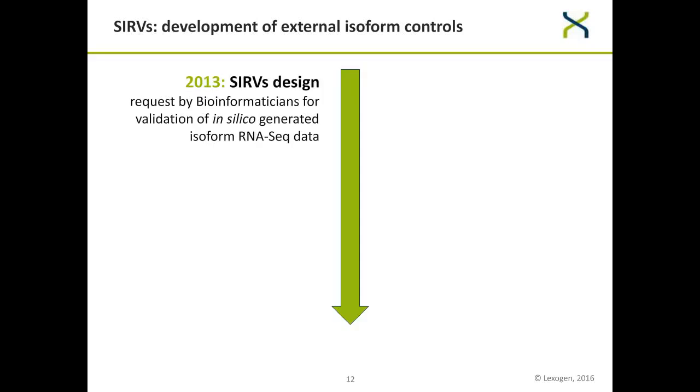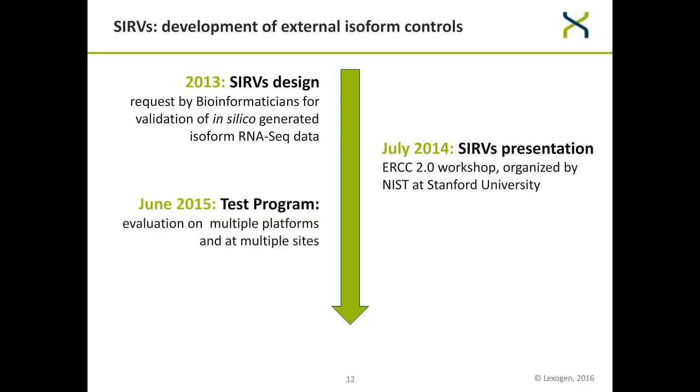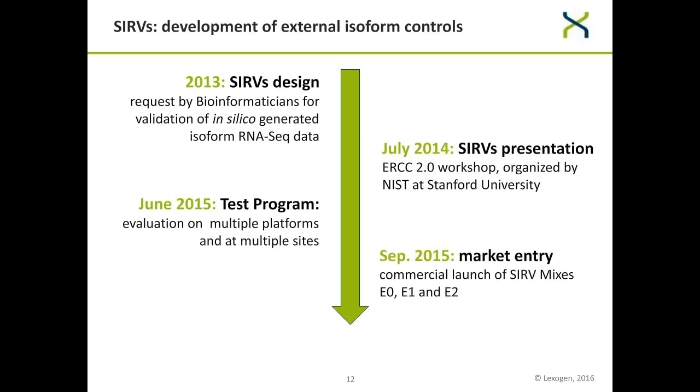So in 2013, we designed the SIRVs, which were then presented in July 2014 to the ERCC 2.0 workshop. This is an initiative promoted and fostered by NIST. The next year, we had a test program where the SIRVs were evaluated on multiple platforms and at multiple sites. We could then release these SIRVs to the market, and the commercial launch was last year in September.